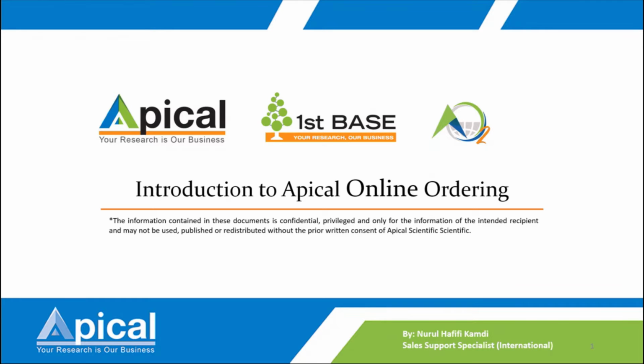There are some differences in sequence from paper to paper, even though it's 27F, so you need to double check. You can find our universal primer sequences on our website. Do confirm the sequence is the same as the one you use for your PCR, then you can use our primer for sequencing.